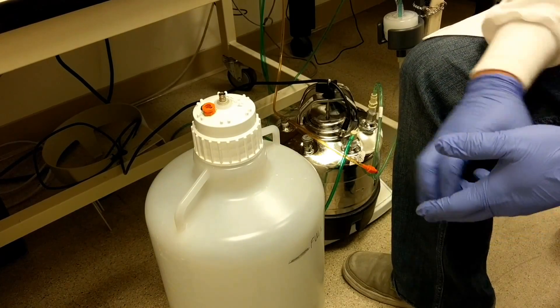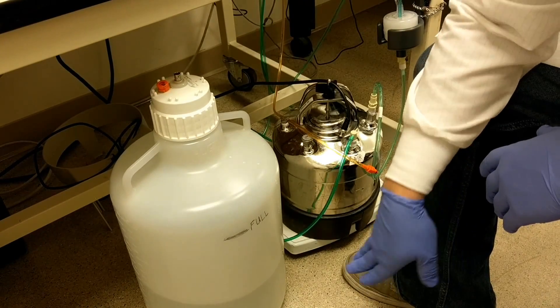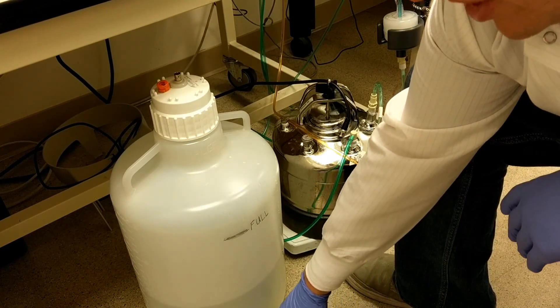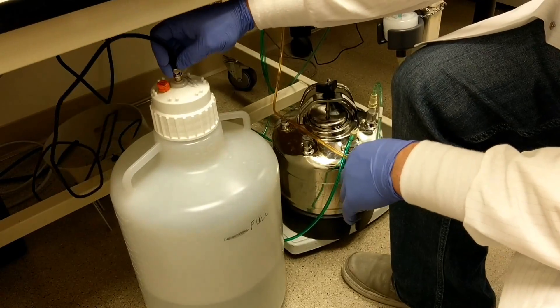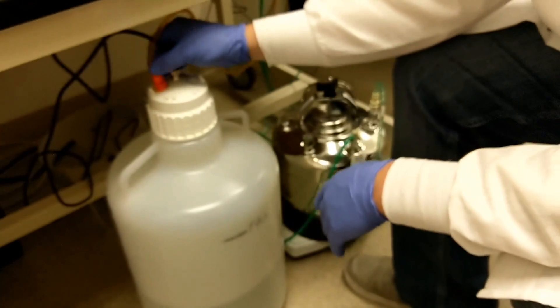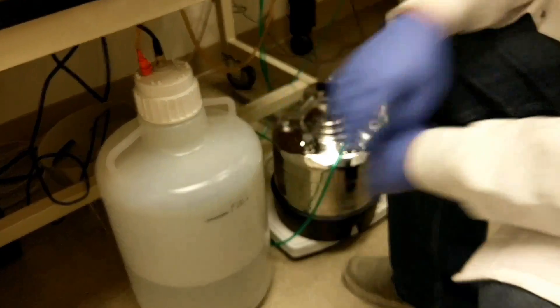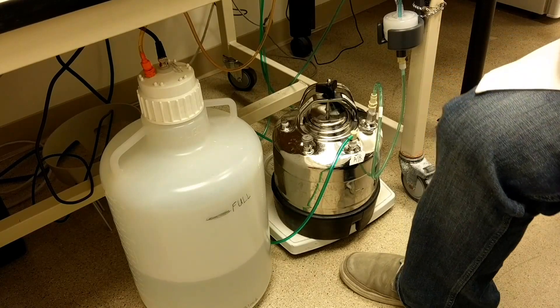When you empty it, under the sink will be a bottle of concentrated bleach that you can fill to this line. Once you've done that, you can reconnect your electronic sensor and your waistline. Make sure that snaps into place, and now you've successfully emptied the waste tank.